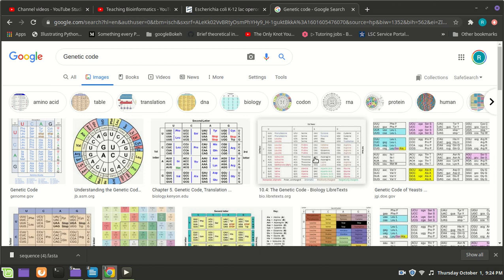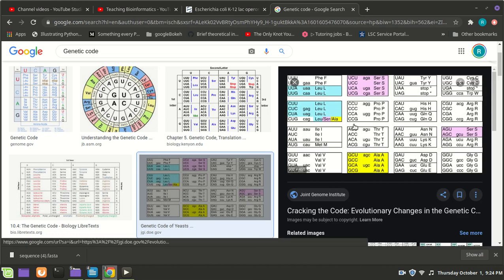Where's one with the single letters? Yeah, right here. Okay. So we want G. So it can be GG something. Are there any other G's? Nope. So GG anything, followed by what's Q?